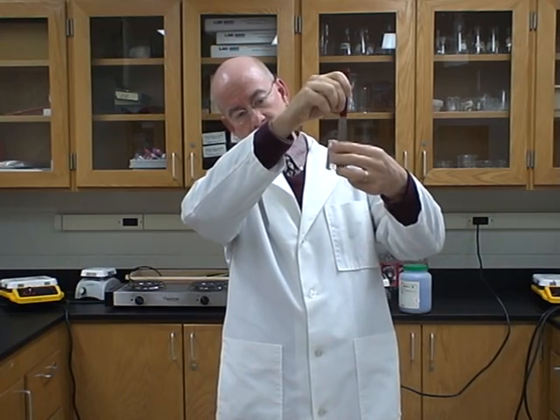Okay. Most of the sugar is pretty much gone. Well, if I were to taste it, which I'm not going to because these beakers are filthy, it would be sweetened water. So sugar and water. There's still sugar, there's still water, nothing new has been produced. So this is a physical change.